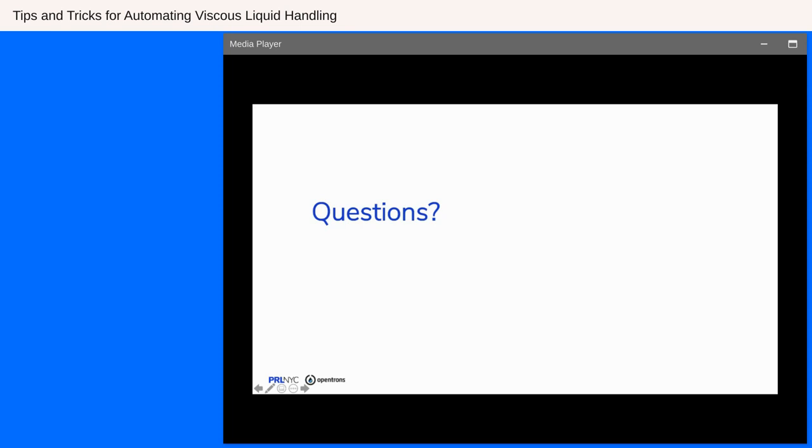Yes. The reason why tips have different effects on the way you're dispensing is, first, the profile of the tip. The way liquid handlers are programmed is using the tip profile. So your plunger displacement can help you in dispensing based on your tip. If the tip has a larger bore, the plunger displacement can be faster. But if your tip has a smaller bore, then it has a different, slower plunger displacement rate.